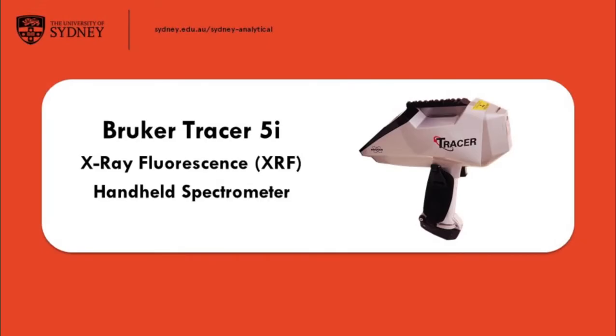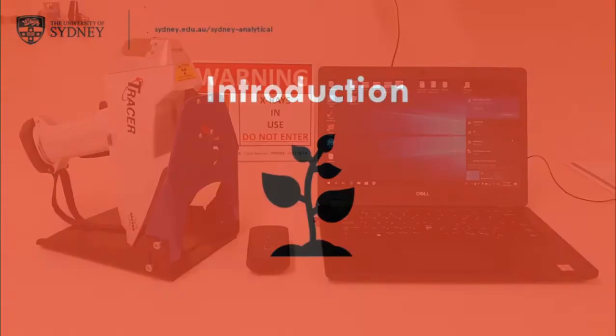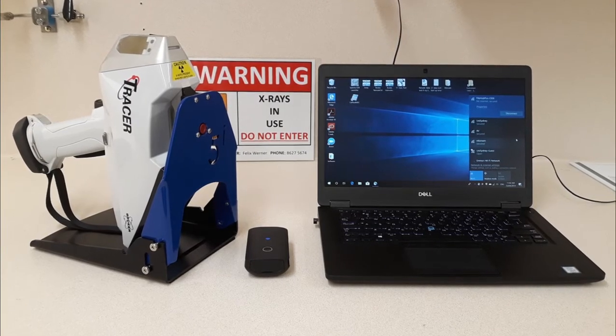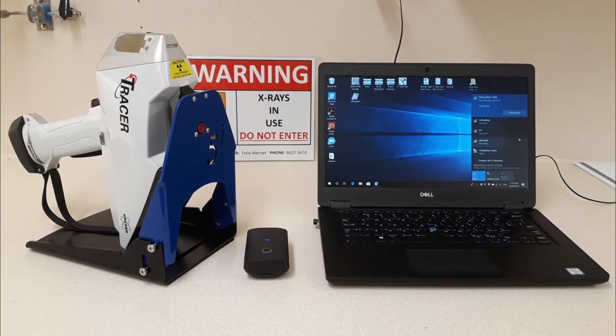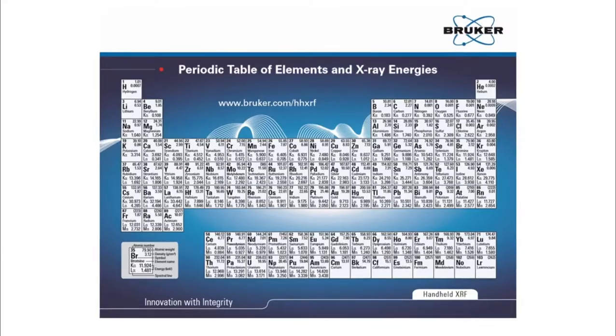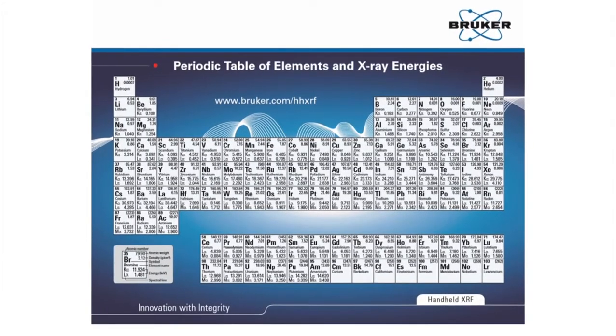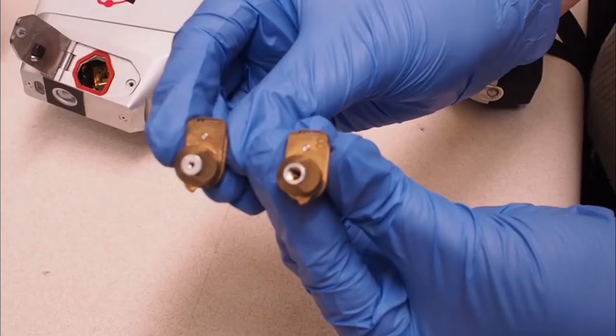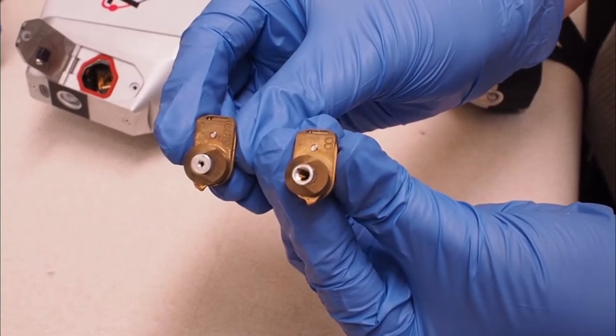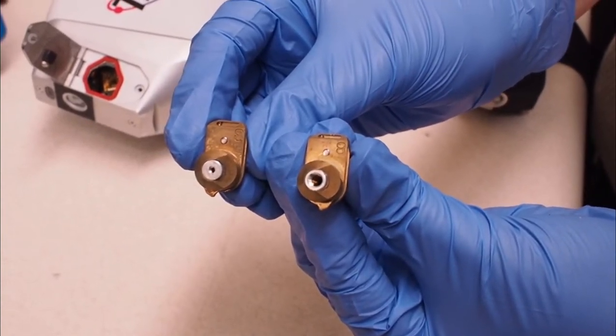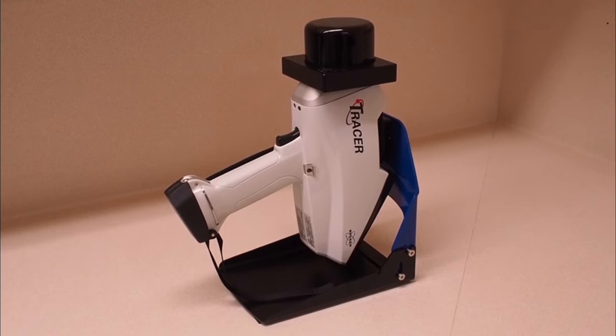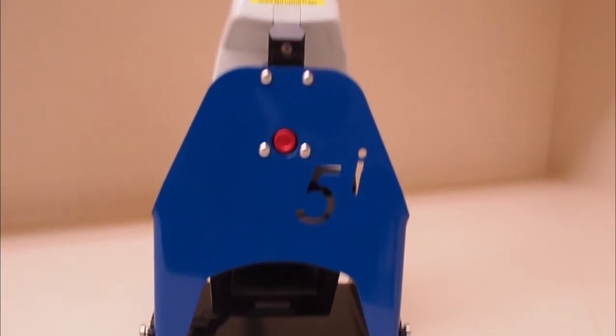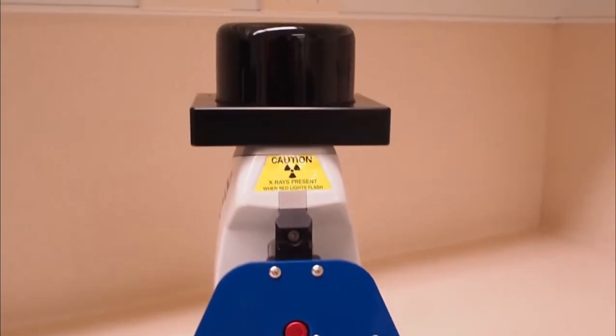Bruker Tracer 5i Handheld Spectrometer. Introduction. The Bruker Tracer 5i is a hand-held energy dispersive X-ray fluorescence or XRF spectrometer, capable of providing non-destructive elemental analysis. Elements from sodium to uranium can be analysed with both 3mm and 8mm collimators available. As the tracer is portable, it can be used either in our laboratory or on site, as long as the correct safety protocols are in place.